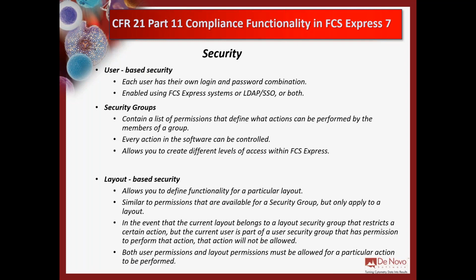That can also be enabled, rather than just using the FCS Express system where you define a username and a login for something. What you can do is use LDAP or SSO. We do have an add-on functionality to FCS Express. It's kind of in addition to security. If you already have an LDAP system or SSO system, single sign-on, that's in place at your institute, you can get that add-on from FCS Express or from De Novo Software, and you can add your users to FCS Express, integrating directly into that system, and it makes everything a lot easier from a system management perspective, and probably also from some compliance perspectives.